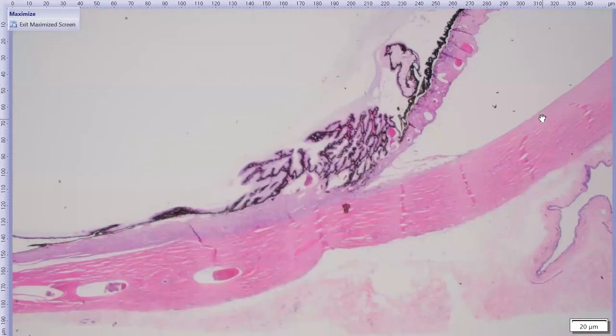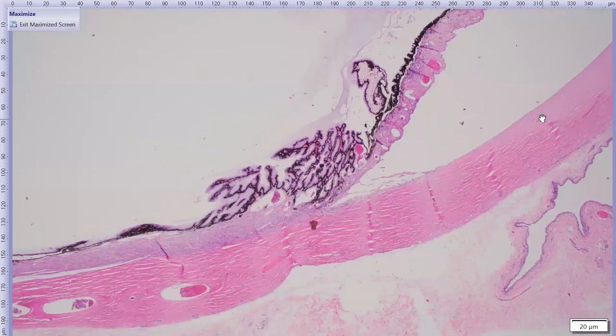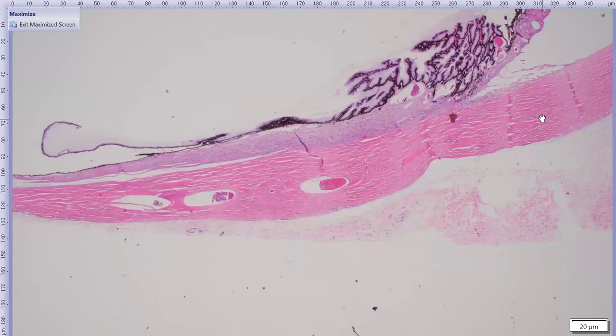However, the iridocorneal angles in this cat are nice and open, and you can make out really distinct and lovely pectinate ligaments. You may think to yourself, well, maybe primary open angle glaucoma in the cat, which is a good differential in a case like this, where the iridocorneal angle is well formed, but we have a clear chronic glaucoma. However, the one histologic sign of primary open angle glaucoma in cats, which is a sort of myxoid or clear looking material deposited around the vessels of the scleral venous plexus, is not here.